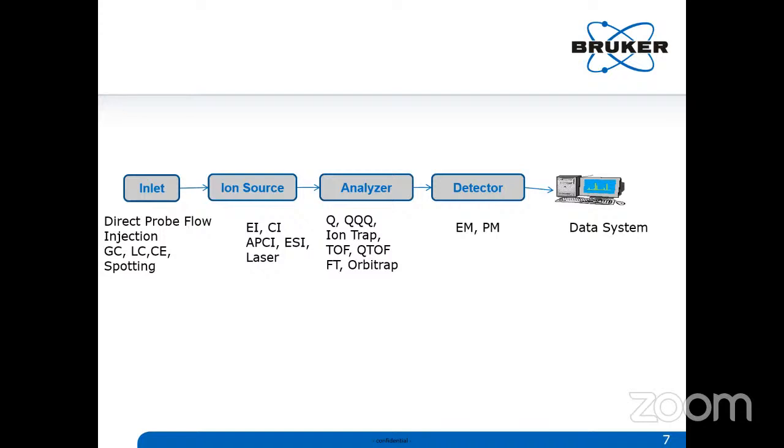Next, the analyzer. Not every sample requires HRMS, and not every sample requires MS/MS fragmentation. When you analyze your molecule, as I mentioned in the previous slide, you will get the mass of that particular molecule in units of Daltons. If it is 1000 Daltons, we keep it as a shortcut, kilodaltons, kDa. In the analyzer you have different kinds of analyzers, as I mentioned: ion trap technology and TOF technology, time of flight, which is how much time your charged ion takes to reach the detector.